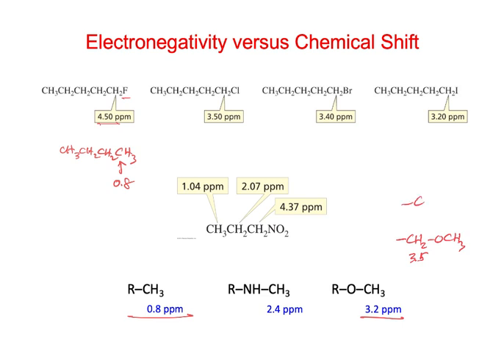But if we had a CH and two methoxy groups, then they're going to add, probably linearly, but not double 3.5 going up to 7. It could be somewhere up around, say, 5.1 or something like that. Okay?